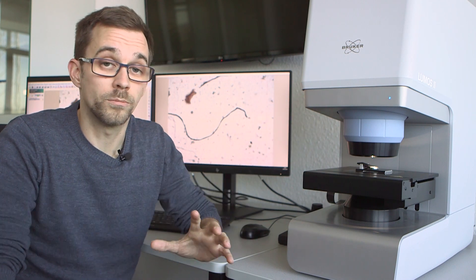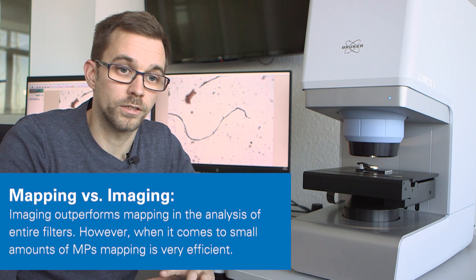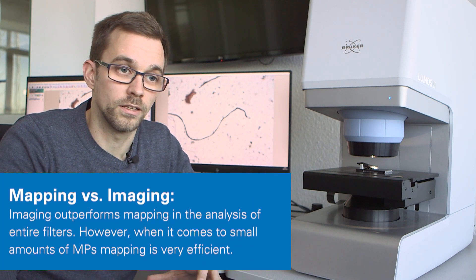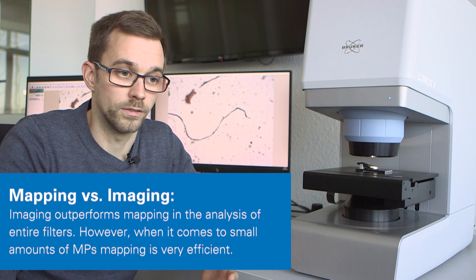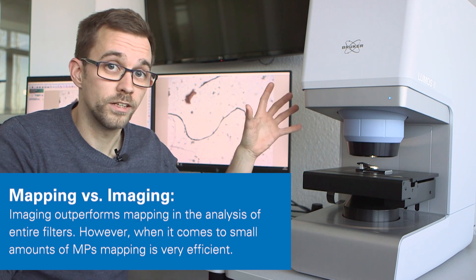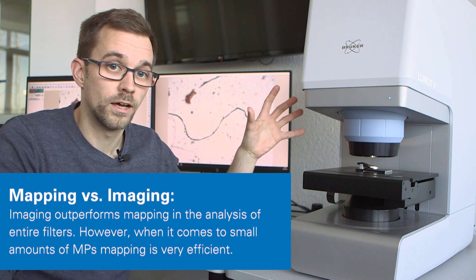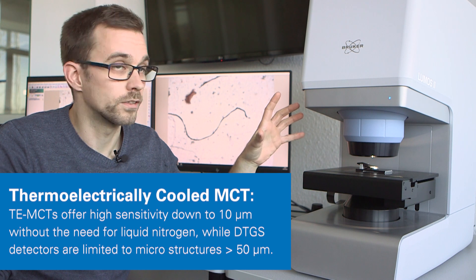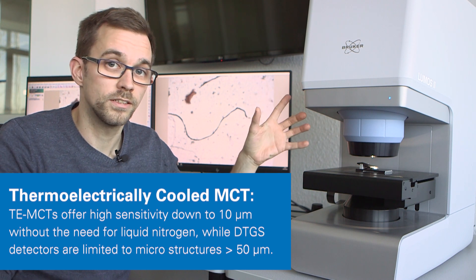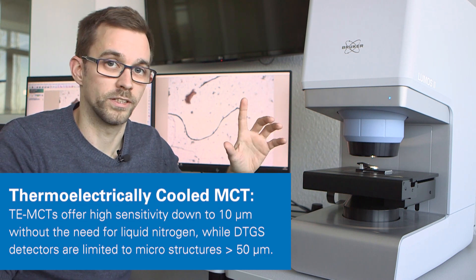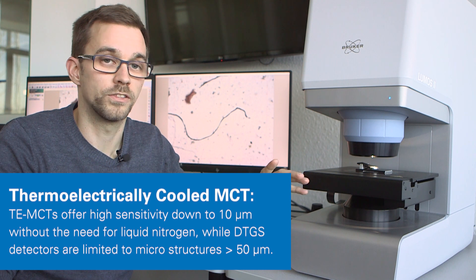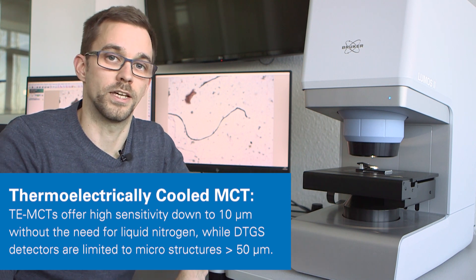This approach is most suited for samples with a low load of particles, like for the analysis of drinking water. The Lumos II is equipped with up to three detectors. For this analysis, we're using the thermoelectrically cooled MCT detector that does not require liquid nitrogen but still can detect particles down to 10 microns.